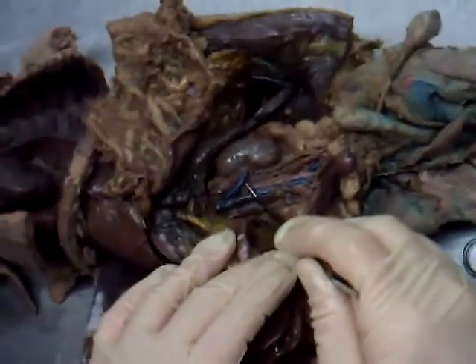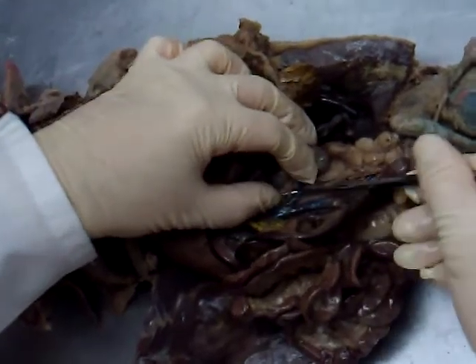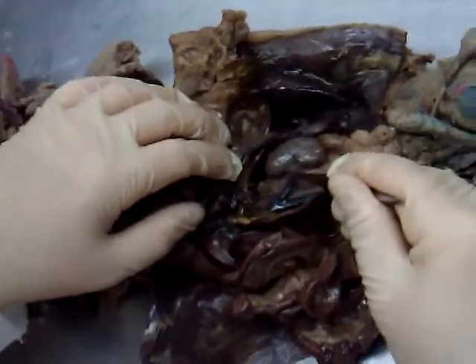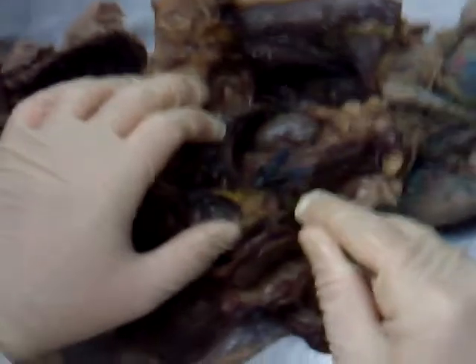Then another vein here — very nice. This is the renal vein, the left renal vein coming from the kidney. Right behind it, you see this little thing right here — that's the left renal artery. And right above the kidney, this little tiny bean-shaped structure here is the adrenal gland — the left adrenal gland.